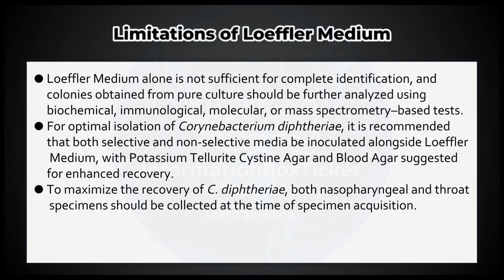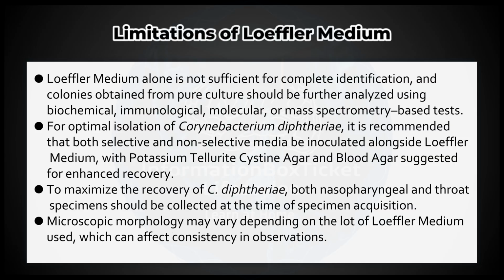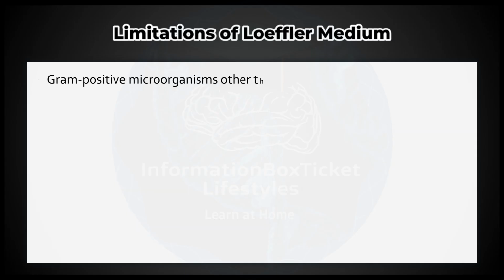To maximize the recovery of C. diphtheriae, both nasopharyngeal and throat specimens should be collected at the time of specimen acquisition. Microscopic morphology may vary depending on the lot of Loeffler medium used, which can affect consistency in observations.